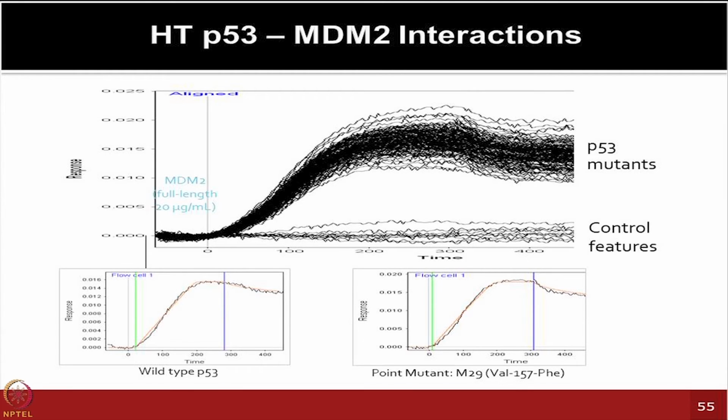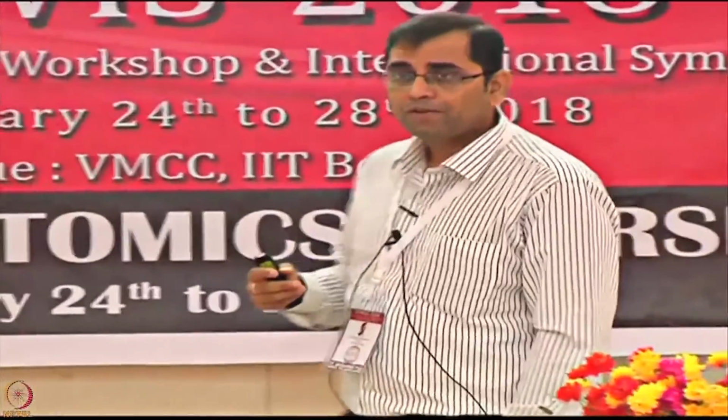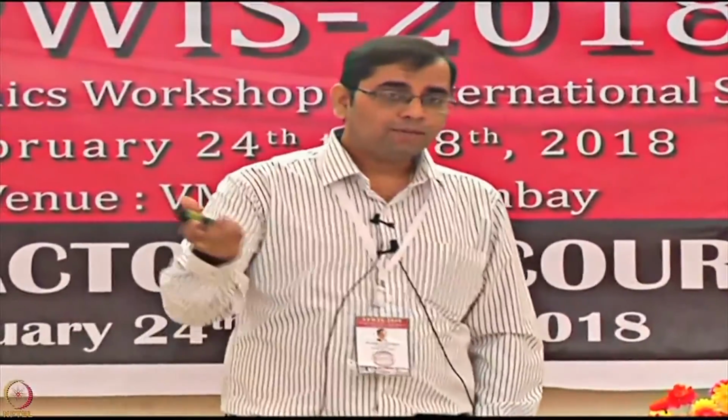Especially, we were also finding that there was probably some sort of bulk effect we could observe even in the control spots. There is some sort of binding which could be observed. So, for the next steps of this technology development, we were seeing that even for NAPA chemistry, the HaloTag chemistry which you are seeing now is showing a much more robust signal. So, could we now try out the same thing on an SPRI platform using the revised NAPA chemistry?